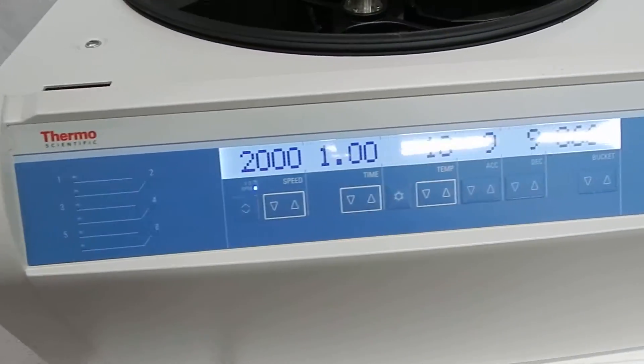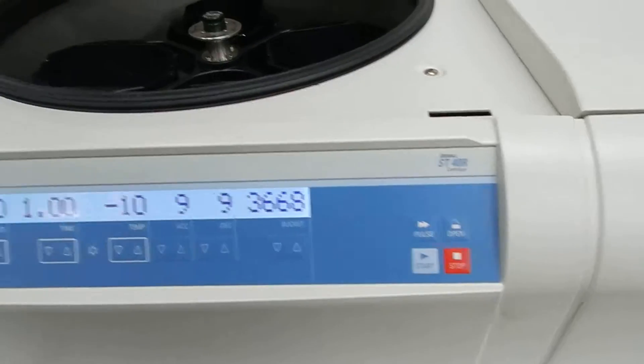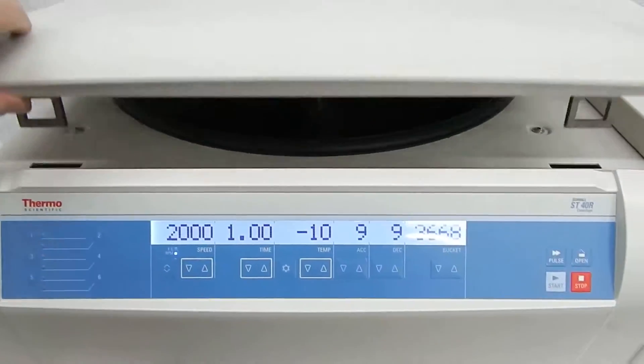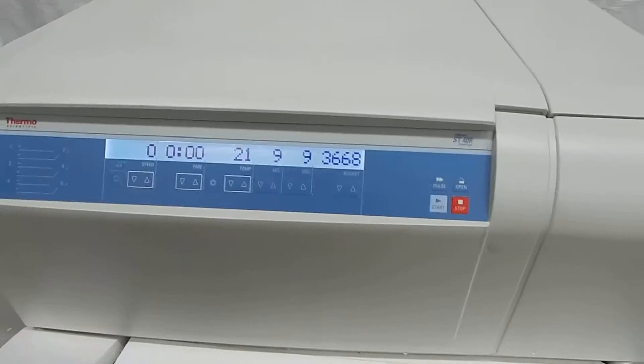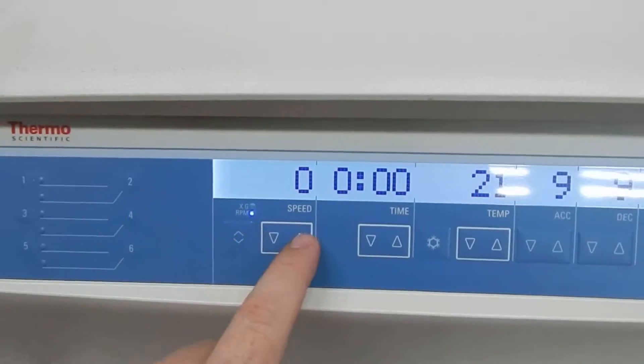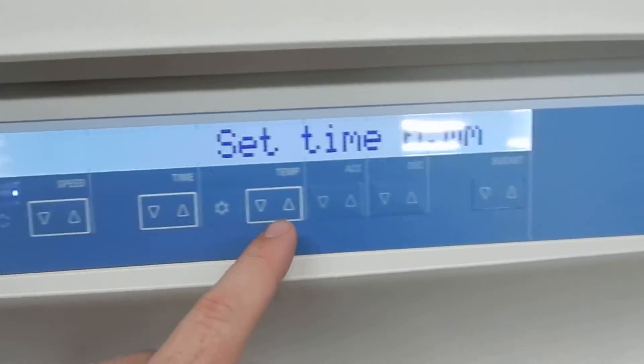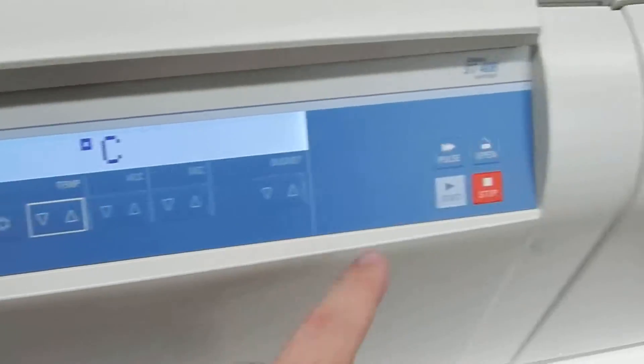Here's this Thermo Scientific ST40R — a customer said it was not working, not responding to any button commands. It was set to 2,000 RPM, one hour run time, and a temperature of minus 10 degrees.